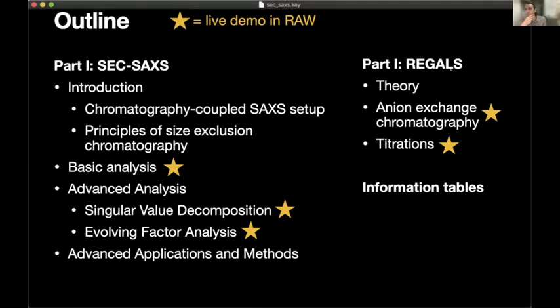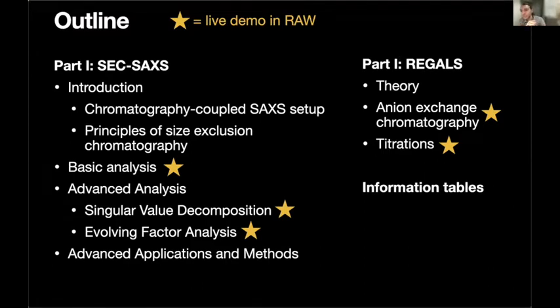And then in part two, this says part one, should be part two, I'm going to tell you about another technique that's similar that we've been developing in the lab called REGALS. It's a kind of general SAXS data analysis tool, but it is particularly powerful for chromatography coupled SAXS data. And I'll show you how we've used it to analyze anion exchange chromatography coupled SAXS, where you have a changing salt gradient during elution, and also how we've used it to analyze titration data. And depending on how much time we have to spend, I'll show you some demos of those as well.